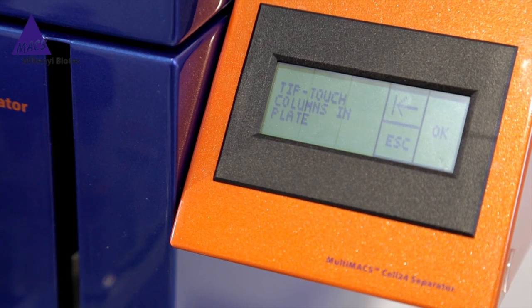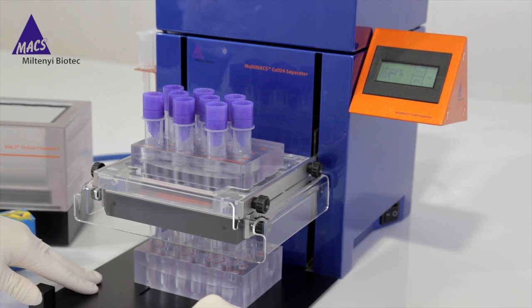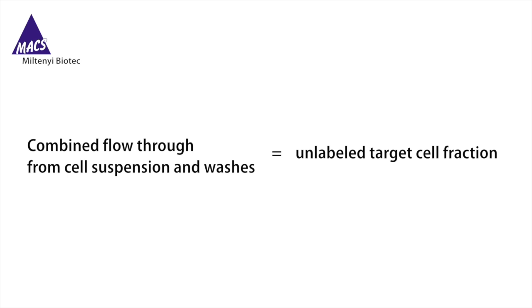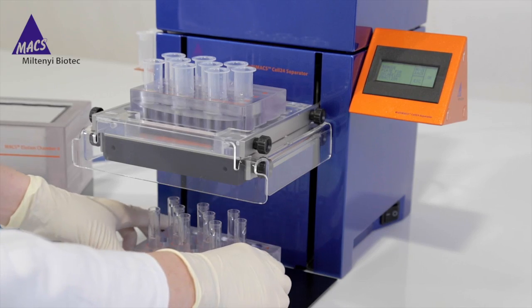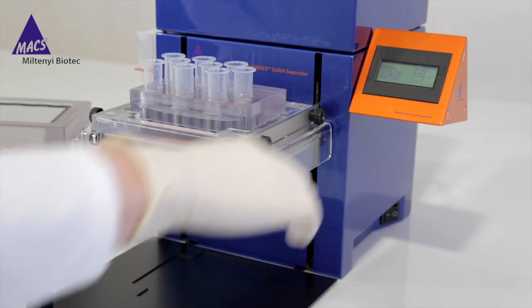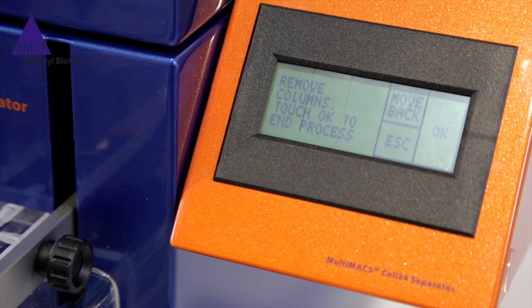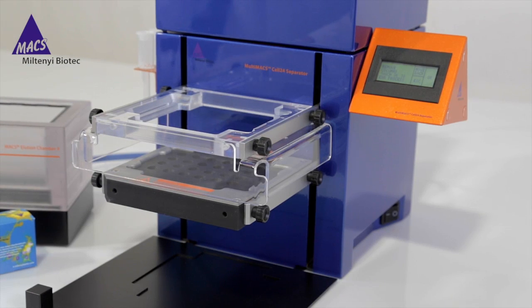Press OK. When 'TipTouch Columns in Plate' appears, move the TipTouch plate firmly back and forth once. Press OK. The combined flow-through from the cell suspension and the washes represents the unlabeled target cell fraction. When 'Remove Plate with Unlabeled Fraction' appears, remove the 5-milliliter tube rack containing the unlabeled target cell fraction. Press OK. You will then be prompted to remove columns — press OK to end the process. Remove the columns containing the labeled myelin. Press OK.